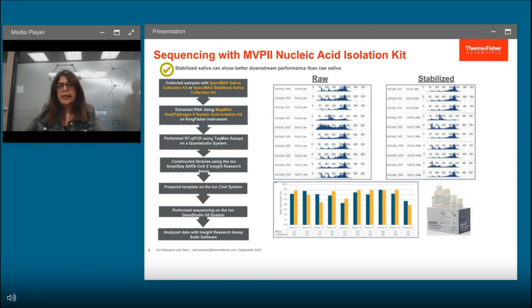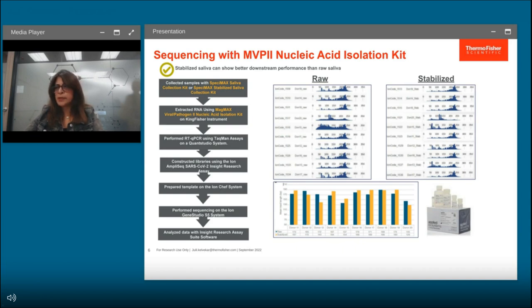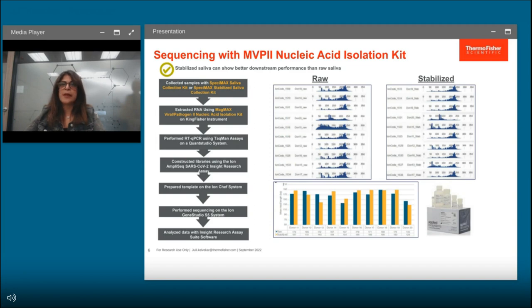RT-PCR was performed using Thermo Fisher TaqPath chemistry on extracted RNA to confirm the presence of SARS-CoV-2. Libraries were constructed using the Ion AmpliSeq SARS-CoV-2 Insight Research Assay panel, templates prepared on Ion Chef, and sequencing performed on the Ion GeneStudio S5 system, with data analyzed on Ion Reporter. The read-length histogram revealed similar profiles across all contrived raw and stabilized saliva samples, though stabilized saliva samples showed cleaner histograms compared to raw samples — notably for donor 15, the raw saliva histogram showed more byproducts. Stabilized saliva shows better downstream performance.